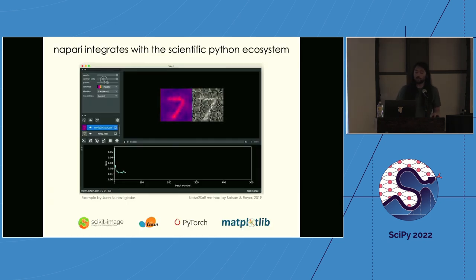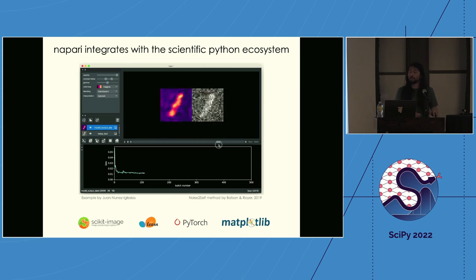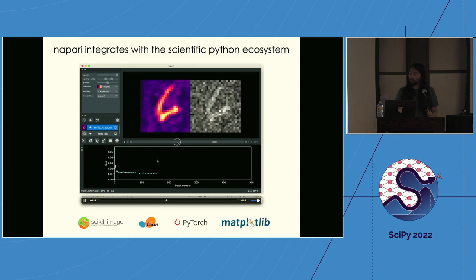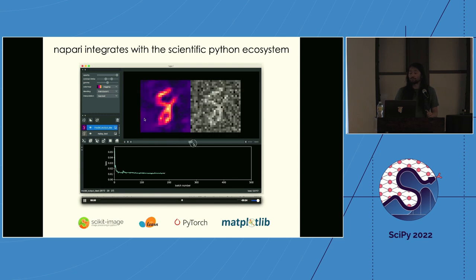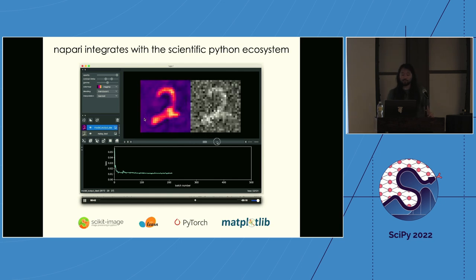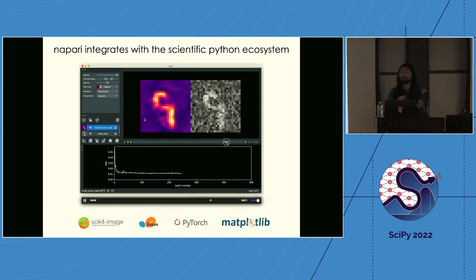Another usage mode — more of an advanced application — is that because Napari is written in Python, you can write scripts that bring together lots of different tools. This example from Juan Nunez-Iglesias shows self-supervised denoising: an iterative process where the algorithm learns to remove noise from images, with Napari displaying the training loss and a preview of what the images look like with current settings. Napari acts as a hub to orchestrate and bring together many different tools.